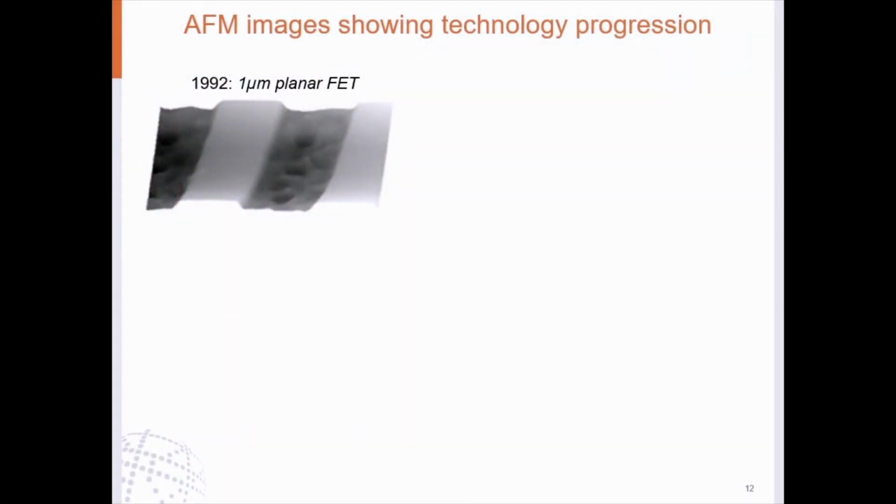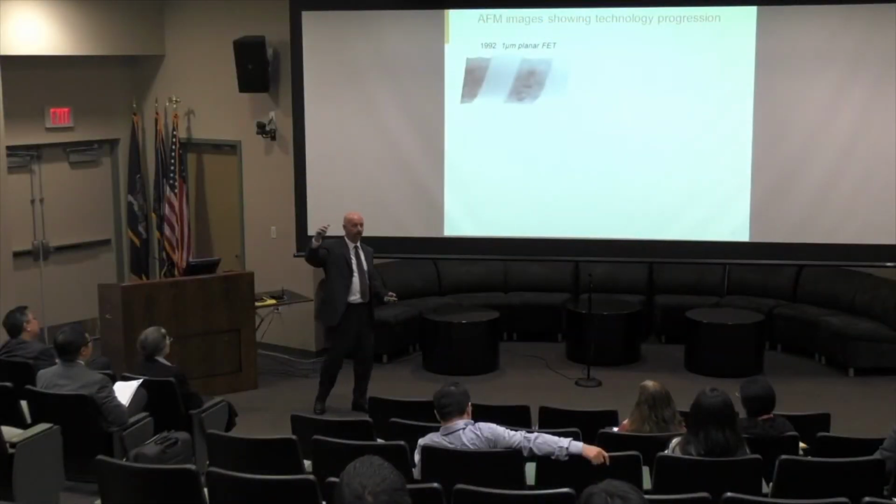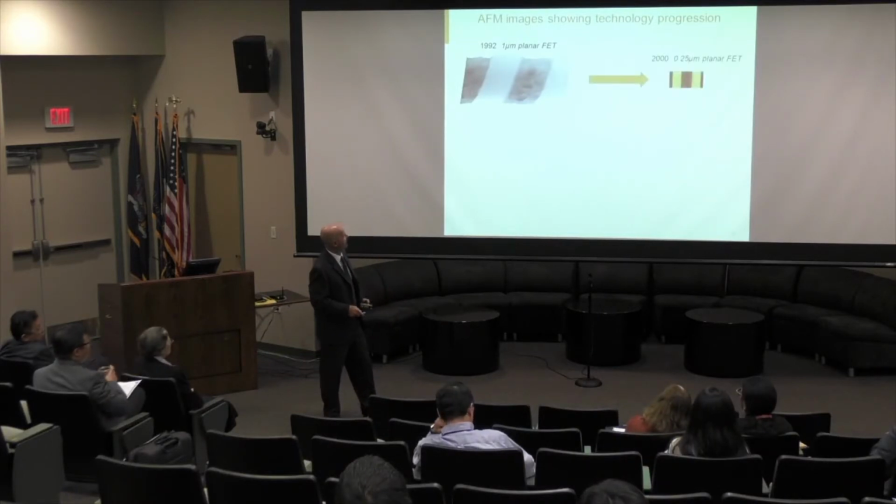I had the opportunity to work with that instrument shortly after it was released from one of our research labs. So this is an image at silicon. I've basically removed all of the materials, just showing the bare silicon. And if you remember back to that cross-sectional view I showed of the FET, the important areas are what has been implanted and diffused down in the silicon. So what I do is chemically delayer this, and we're looking at silicon here.